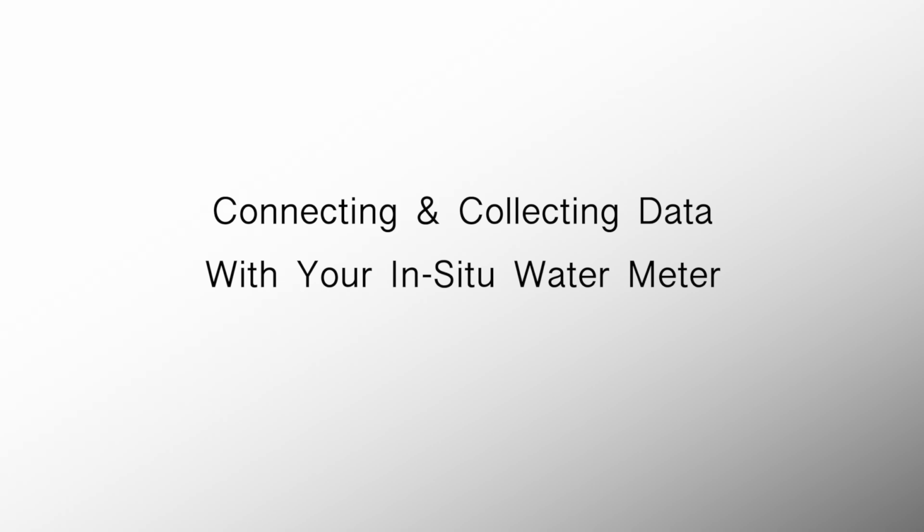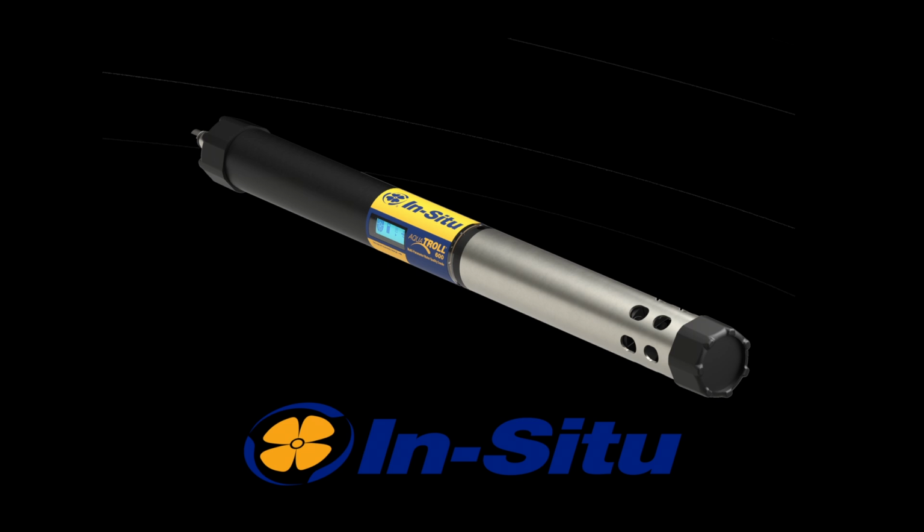Connecting your In-Situ Water meter to the Field Data Collection app. If you're using In-Situ Water meters to collect groundwater data when low-flow sampling, you can connect your meter to the Field Data Collection app to have groundwater data automatically upload to the platform.